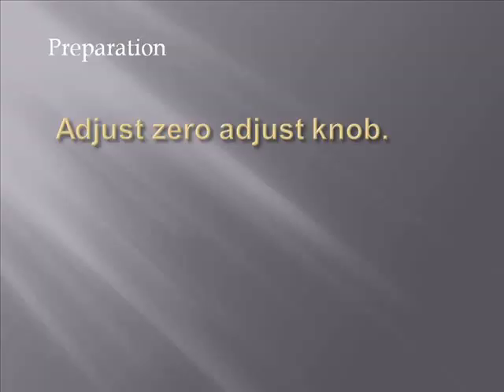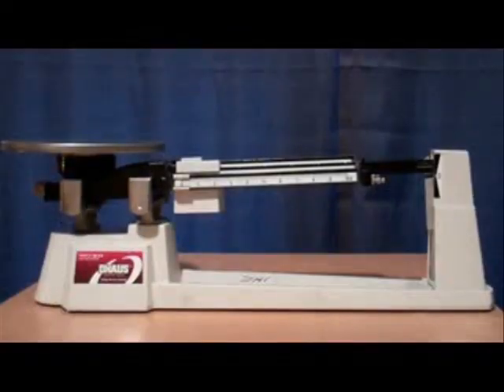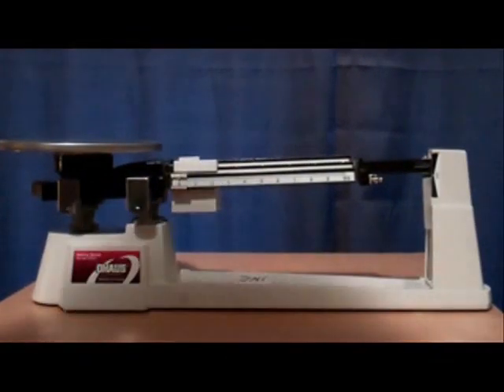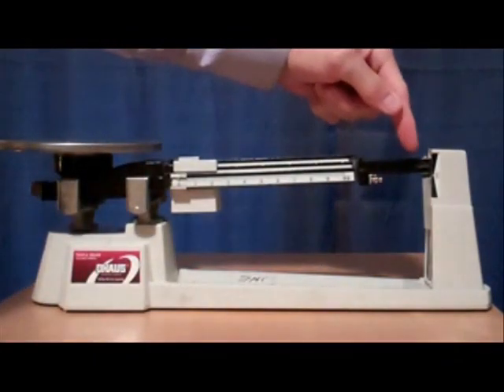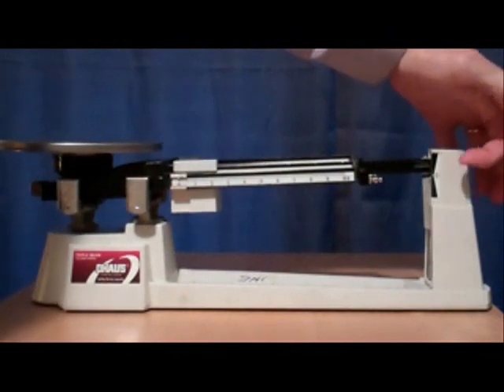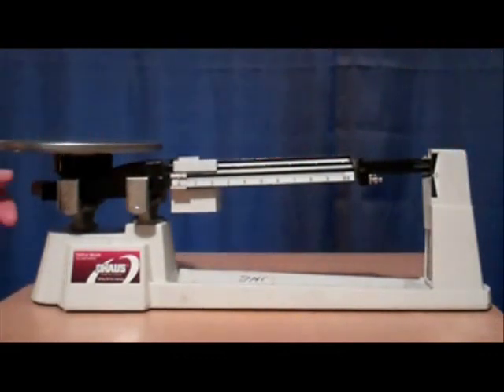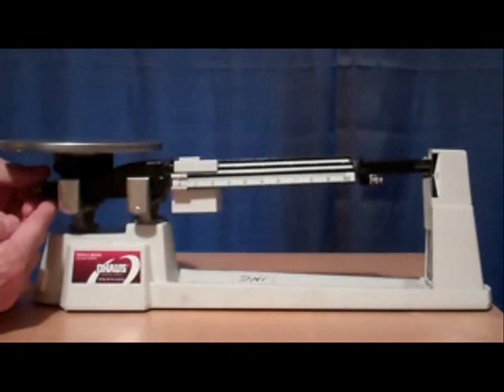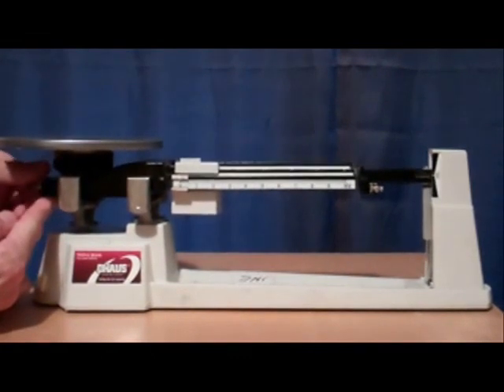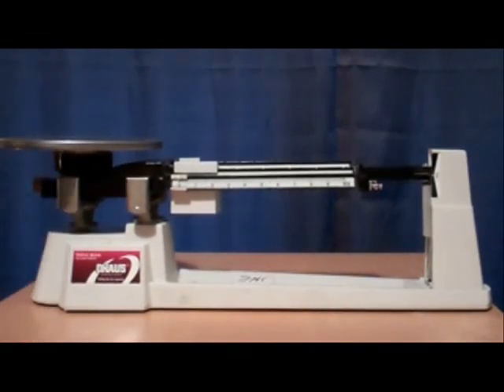The third step in preparing the triple beam balance for use is to adjust the zero adjust knob. This scale needs adjustment because the pointer is not lined up with the zero. To do that, you need to work on the opposite side and screw in a small knob until the pointer lines up with the zero.